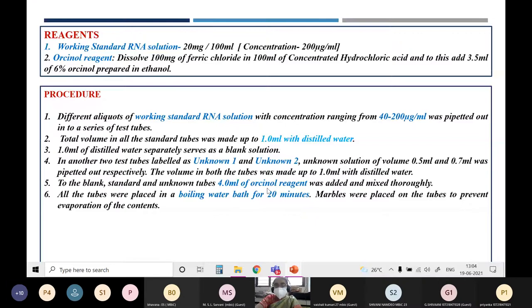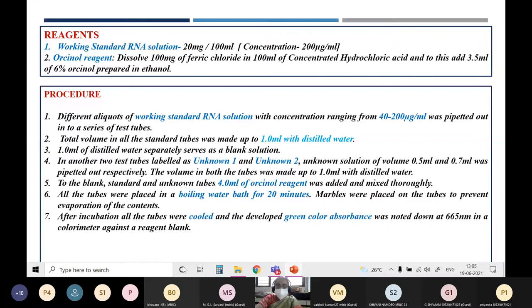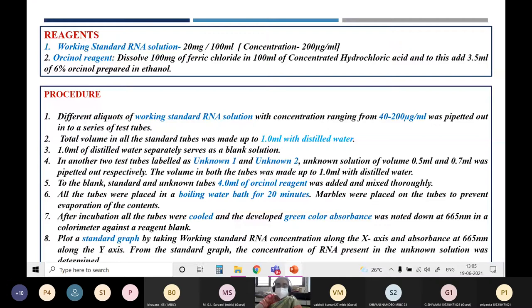The time limit in the boiling water bath is 20 minutes. To avoid evaporation of contents, place marbles on top of all the test tubes. After 20 minutes of incubation, cool all tubes thoroughly and measure the developed green colour absorbance at 665 nanometres using a colorimeter against a reagent blank. Then plot a standard graph with working standard RNA concentration along the x-axis and absorbance at 665 nanometres along the y-axis, and from the graph determine the concentration of RNA in the unknown solution.